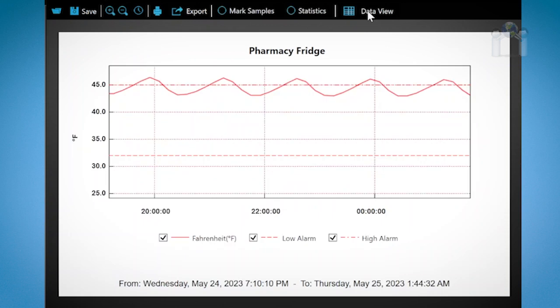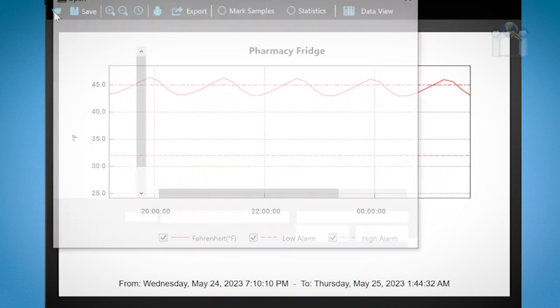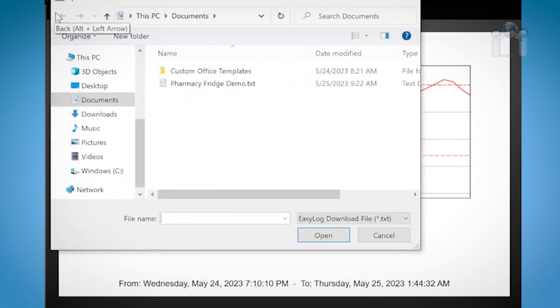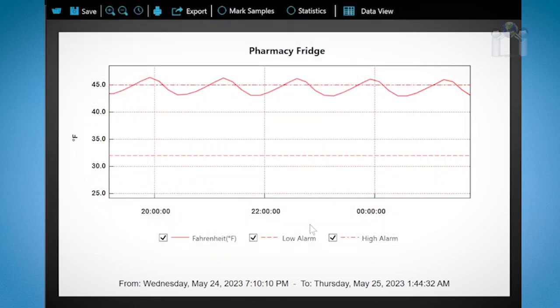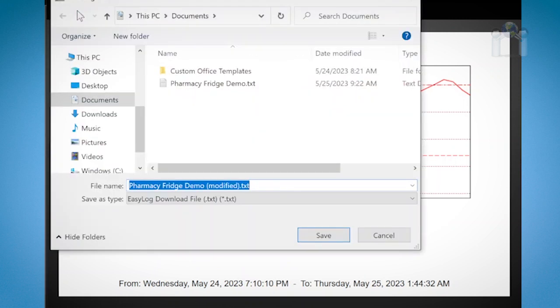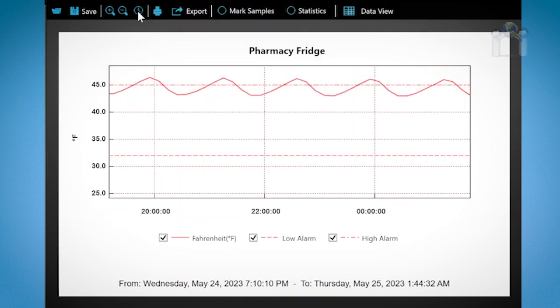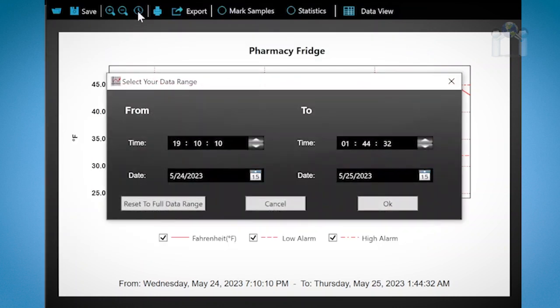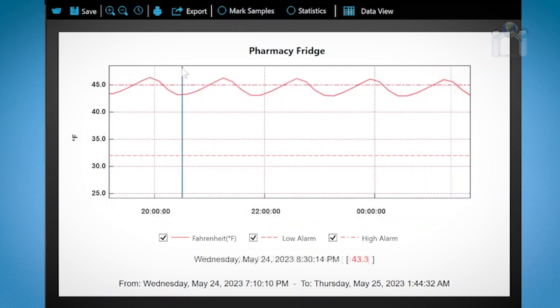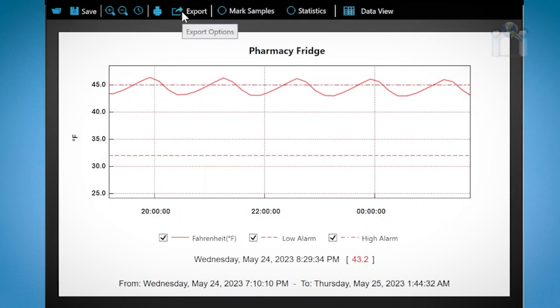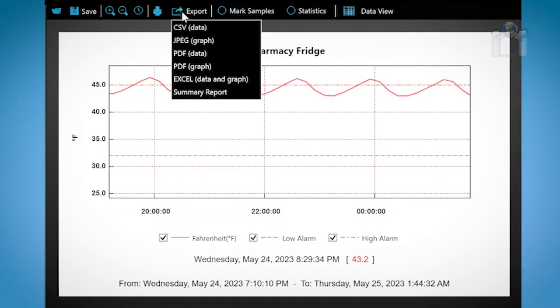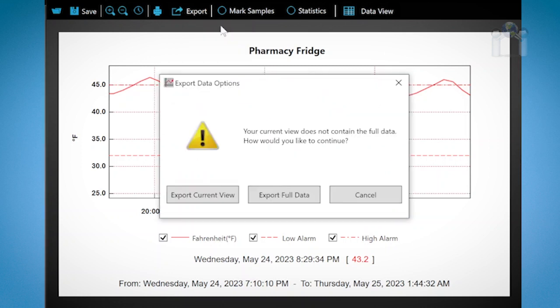Let's take a look at other actions you can perform from the menu. Click on the folder to load other data that has already been saved. Click the disk to save the data that you are currently viewing. This is useful to save the data to another location. The watch face opens a window to allow you to type in the desired date and time range to view.